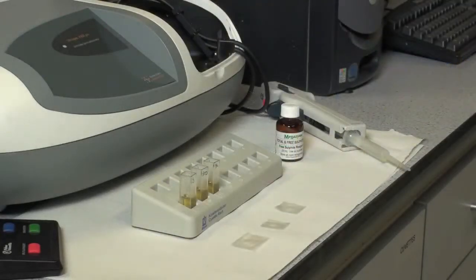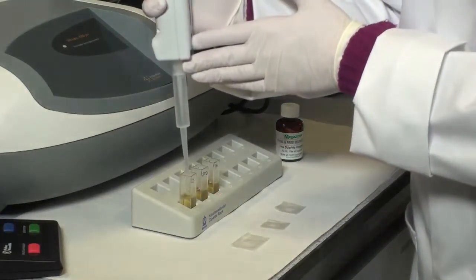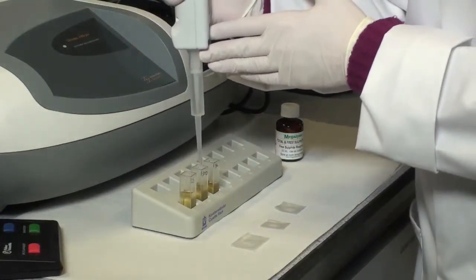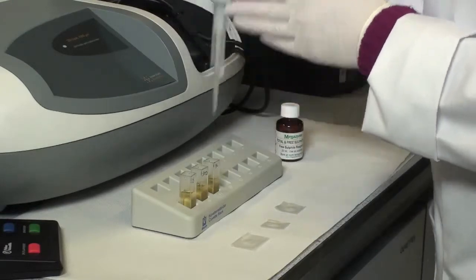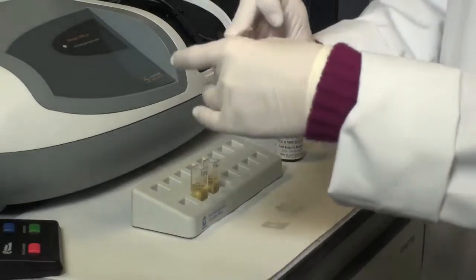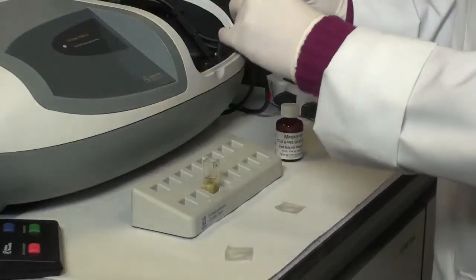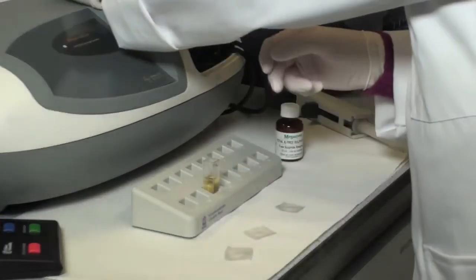After reading absorbances A1 for each of the solutions, add 0.05 millilitres of Free Sulphite Reagent 2 to each of the solutions. Mix each solution, then exactly 3 minutes after the addition of Reagent 2, read the absorbance A2 for each solution.